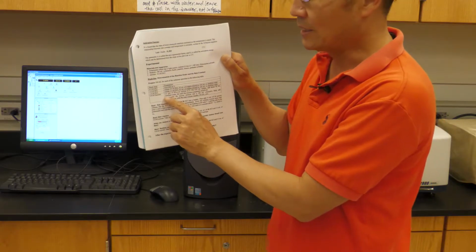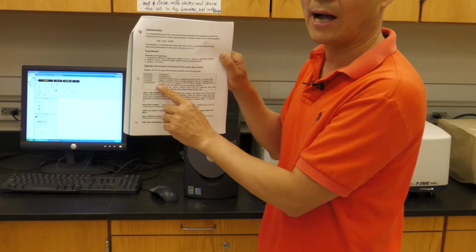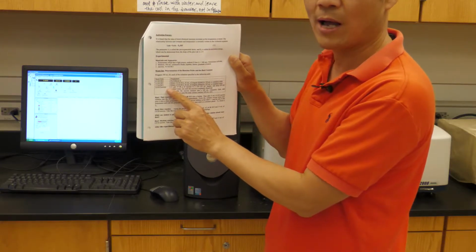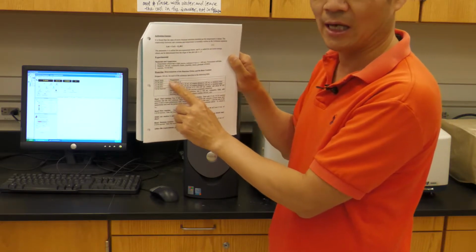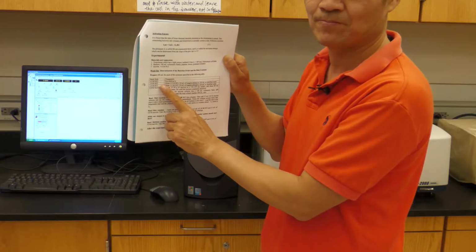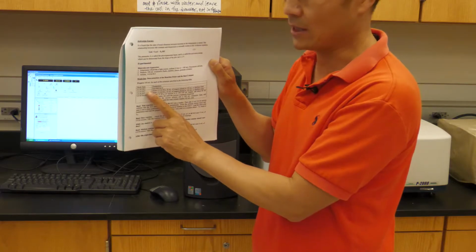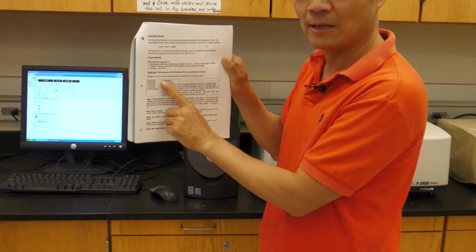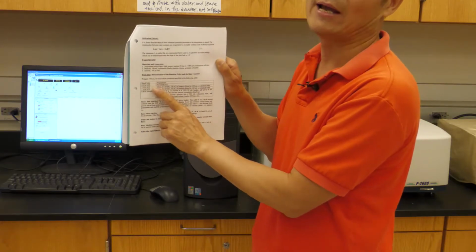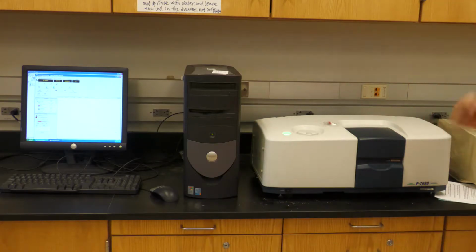That is the first thing. Now you need to prepare these solutions based on your general chemistry or analytical chemistry. Use M1V1 equals M2V2. Use the concentrated HCl, which is 12 molarity. You need to calculate how much you need and how much water to add to make the 8 molarity. Then dilute from the 8 molarity to the 6 molarity and 4 molarity for your lab use, okay? This is the first part.